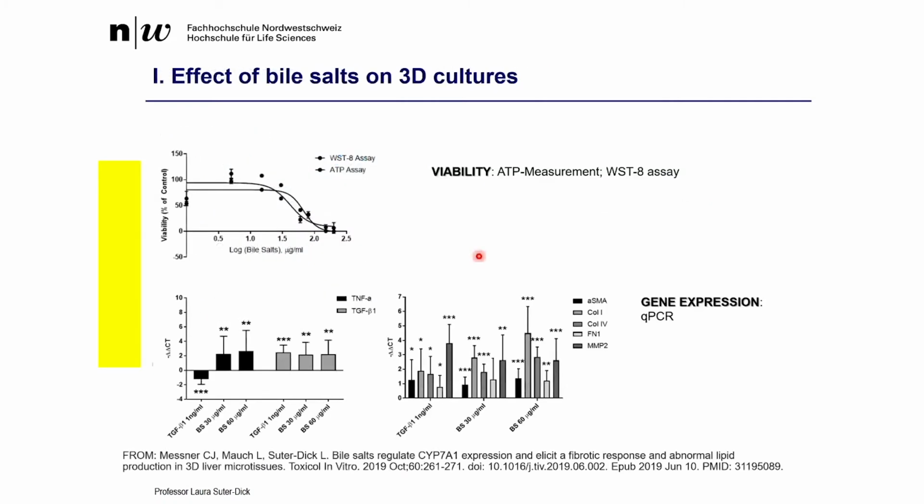And what I can show you very briefly is how this data that you can generate with these microtissues may look like. Again, I don't have the time to go into a big lecture on the toxicology of bile salts. It's not my intention. I just wanted to show which type of data you may be able to obtain using these methods. On the one hand, I mentioned the ATP assay for viability. This you're going to see in a minute. There are other assays for viability. Here we compare two different assays. You see that the bile salts are actually toxic.